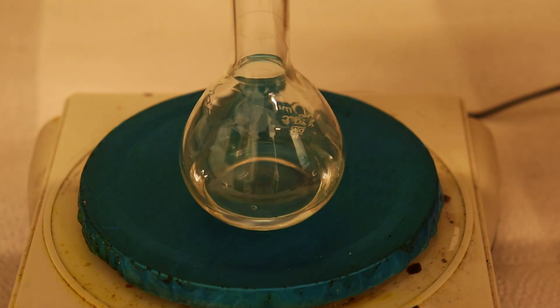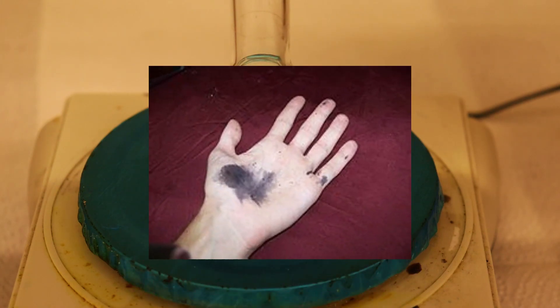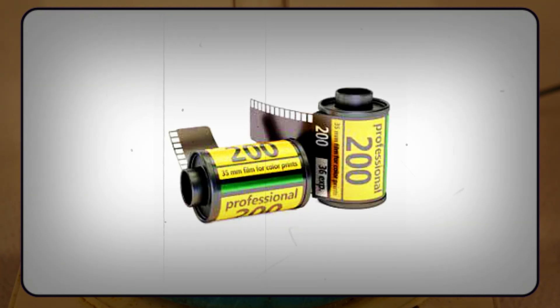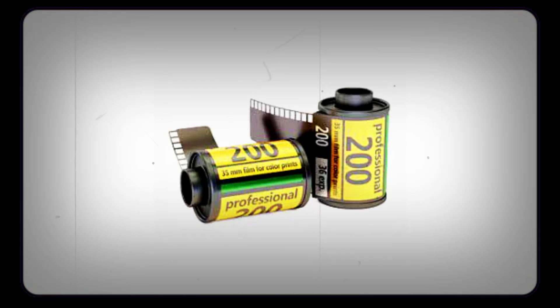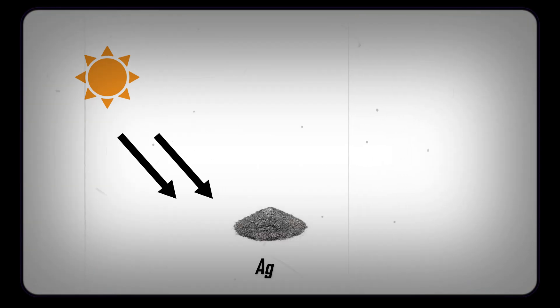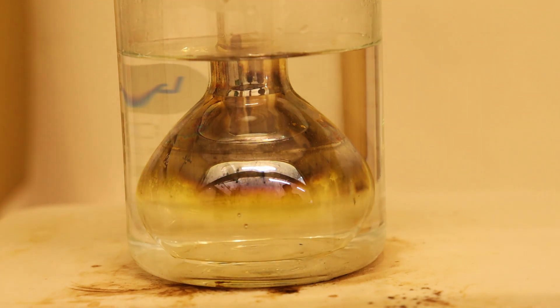But it has a very annoying side effect — if it touches your skin it will permanently stain it black. In the past, silver nitrate was even more extensively used in photography, as it decomposes under light producing elemental silver that stained the paper and therefore produced a negative photo. It was also used to make mirrors, a process that we will try in this video along with some other reactions.